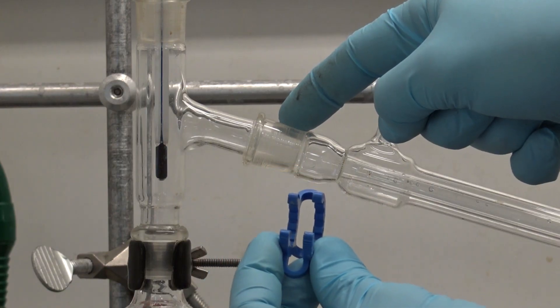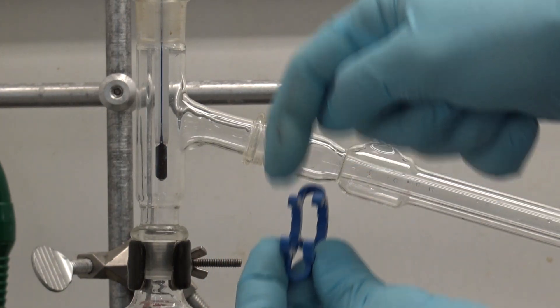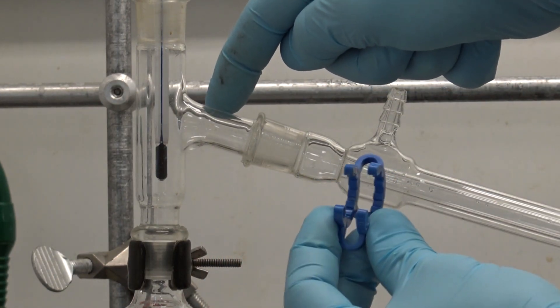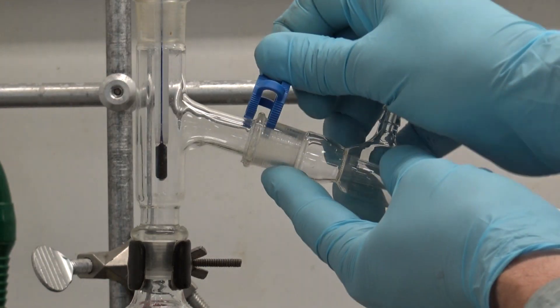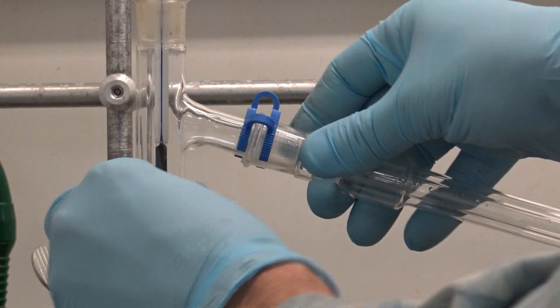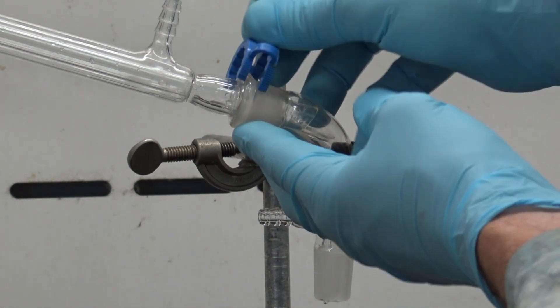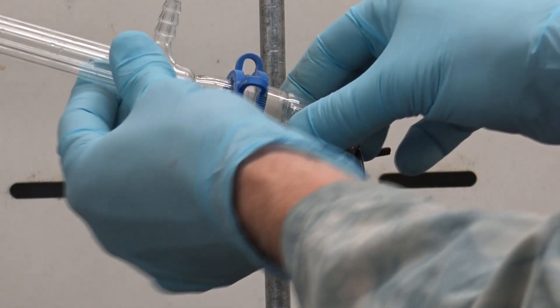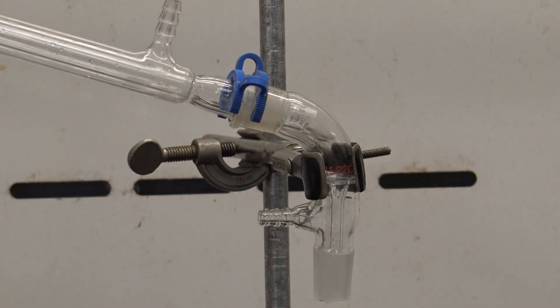Next I'm going to place a keck clip which has a large side and a small side just like the glass joint does right over that condenser. Notice that when I put the large side over the female and the small side over the male I get a good snug connection. I'll do the same thing at the other end to be sure that that condenser stays in place because it's not clamped itself.